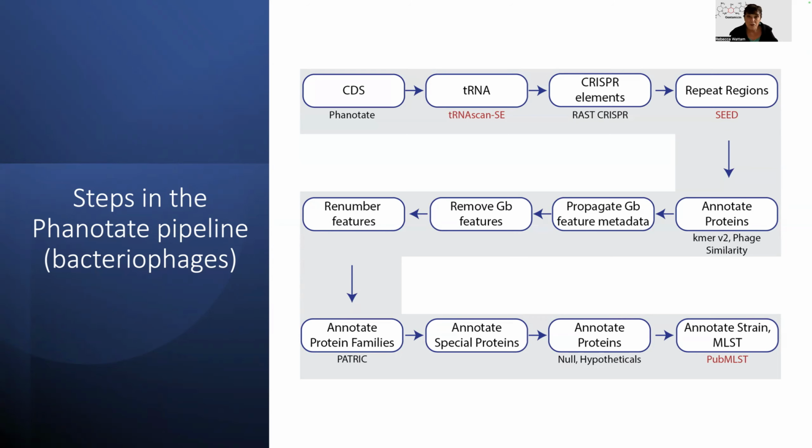But speaking of trees, you could do the viral genome tree because it is a virus. And the viral genome tree service relies on differences in the nucleotide sequence, or the bacterial genome tree, which is looking at the protein families. So that's the bacteriophage pipeline.